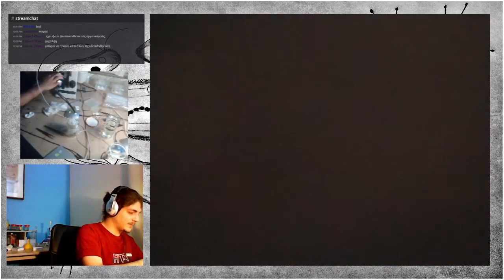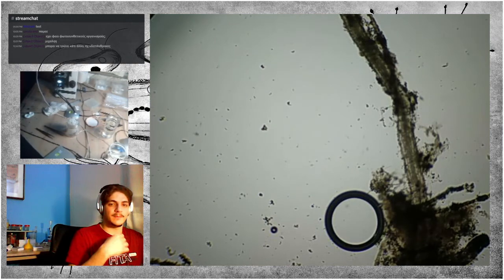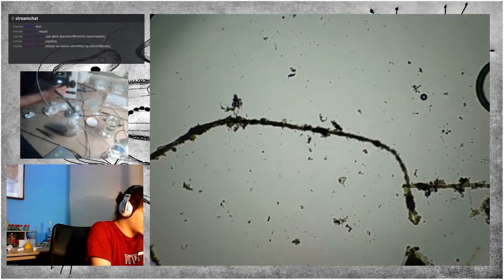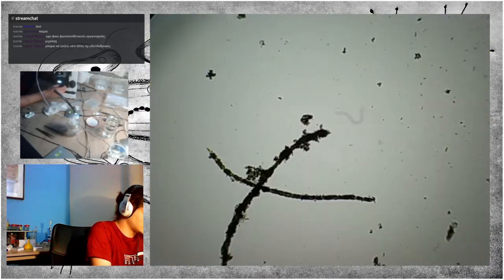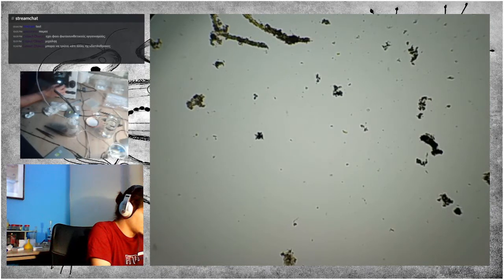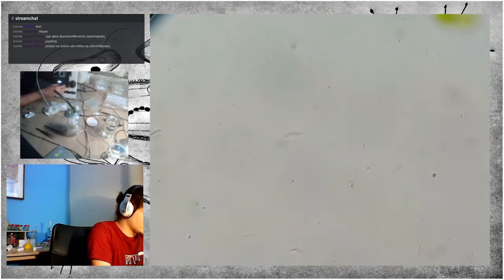There's that danger, and that is another reason why you want solid material inside the slide. Now I can already see some microorganisms roaming around. Not roaring, obviously. That might be what I'm seeing. Oh, here's another spirochete. Where is it? There it is. A bigger one.